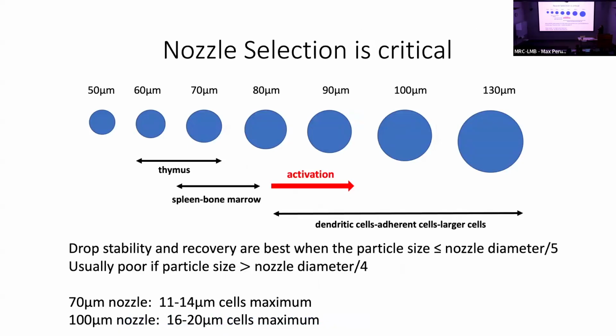You're going to have potentially things like bacteria or even archaea that we analyze in Buzz Baum's lab, which are very small, less than a micron or about a micron, anywhere up to things like lymphocytes or granulocytes or any kind of cell line that's much bigger. We can choose various nozzle sizes to suit the specific needs of the particle that we're sorting.